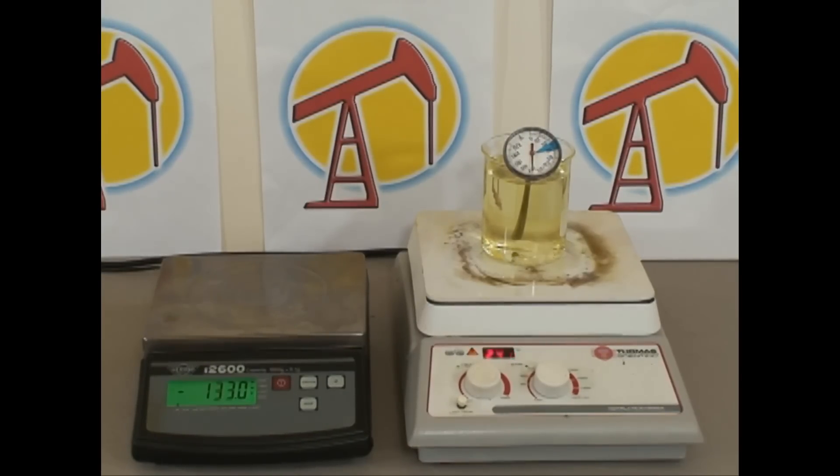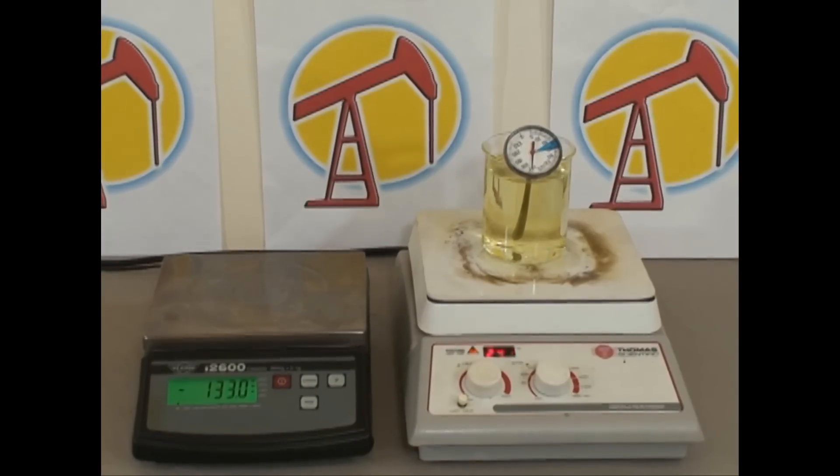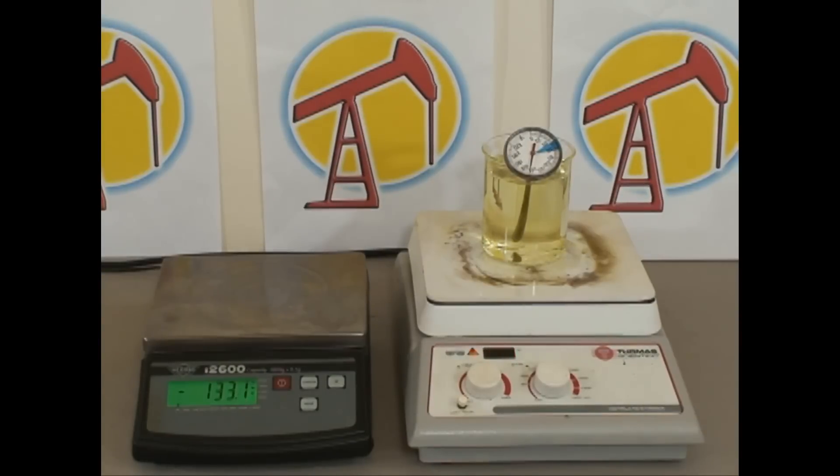Hot plates that you cook on — single-eye hot plates with a stove element on the top — generally run ten to twenty bucks at department stores or on the internet. That's a lot cheaper than three to five hundred dollars. You can use those, but you just don't have the stir bar.